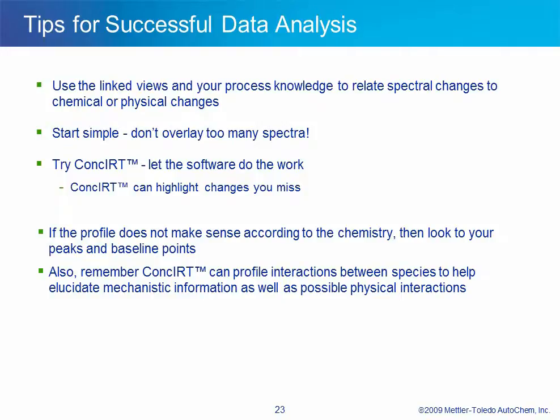So let's just go through some tips for successful data analysis. I highly encourage that you use the linked views and the process knowledge that you have to relate spectral changes to their chemical or the possible physical counterparts. It's very helpful. Annotations, I can't tell you how much we highly recommend annotations, because it does make the data analysis so much more straightforward.